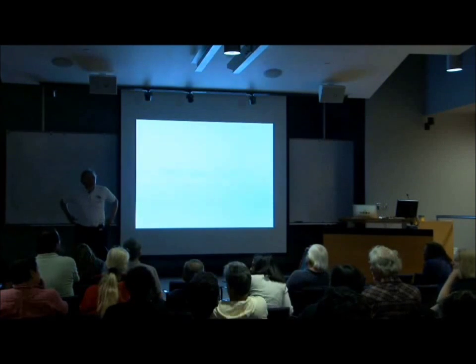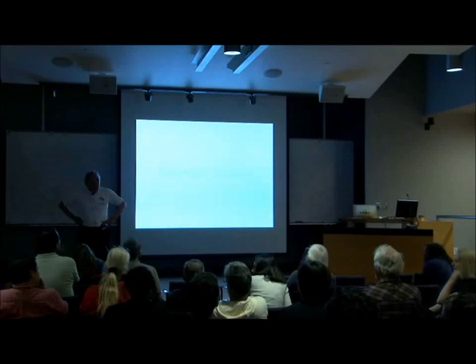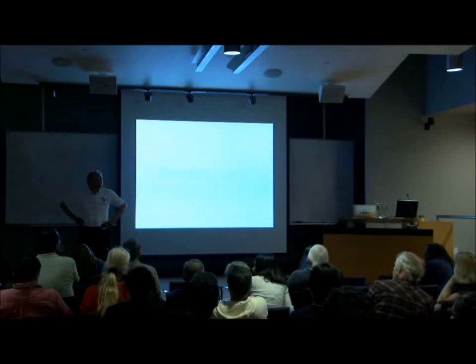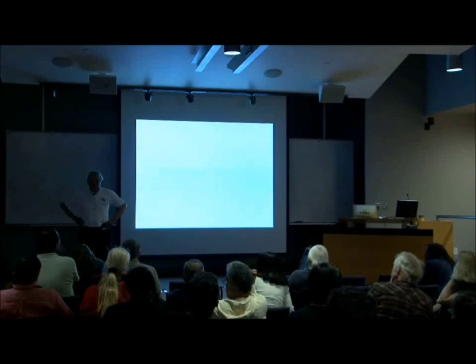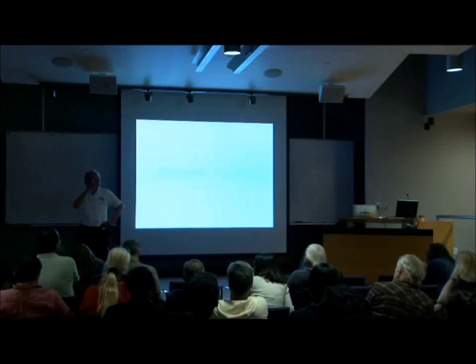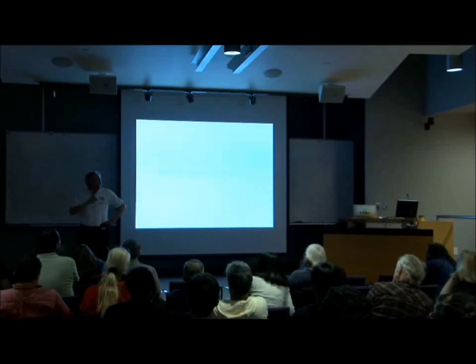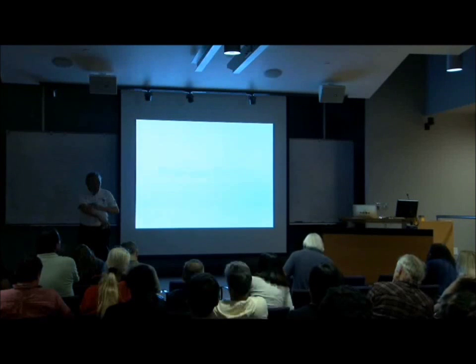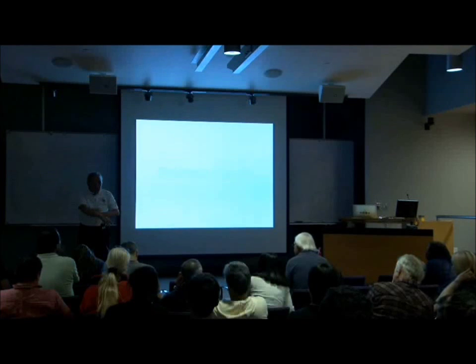What do you do? Calcium gluconate, right? Now, what else? What's the medical protocol for exposure? If you suspect exposure, you flush, you start applying the calcium gluconate solution, right? That's your topical to start the neutralization reaction on the surface. What else should you not do?